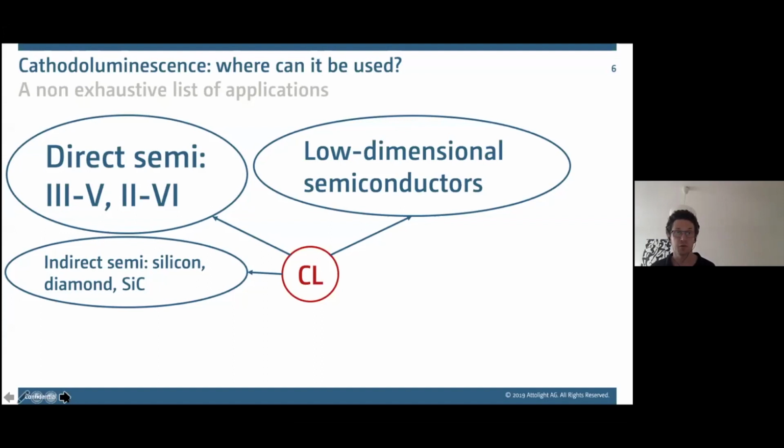This is the case with diamonds, where again you can measure dopant concentration and see some defects, and also with silicon carbide, where you can really see a bunch of things because this is a material that's a little more tricky to both elaborate and dope. Yet it's really important because you have an up and coming power electronics industry behind this material.